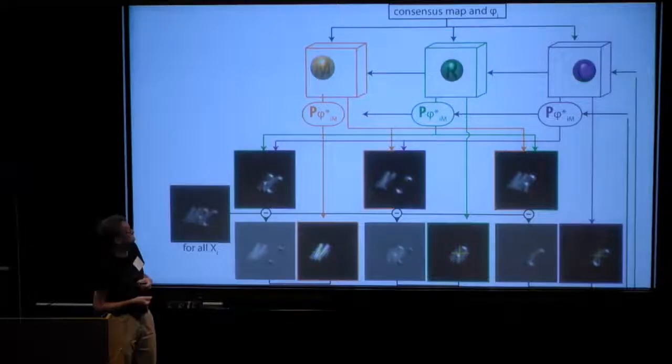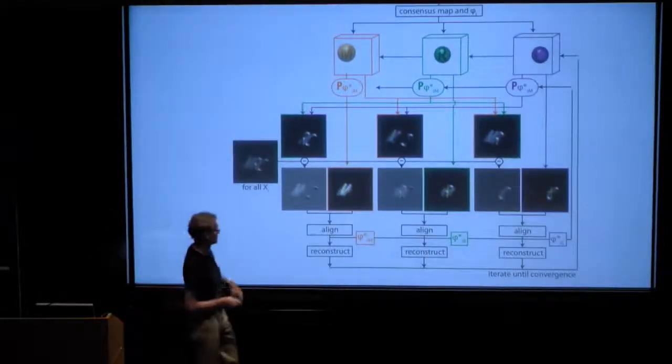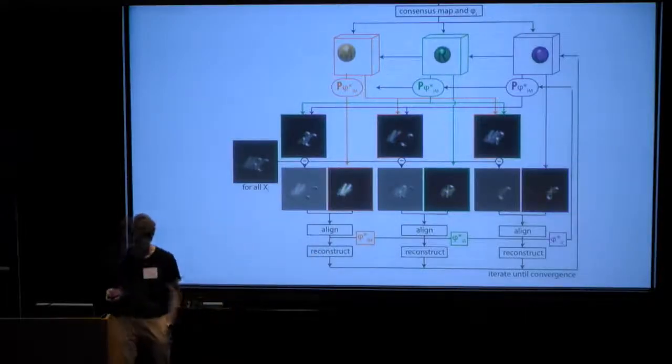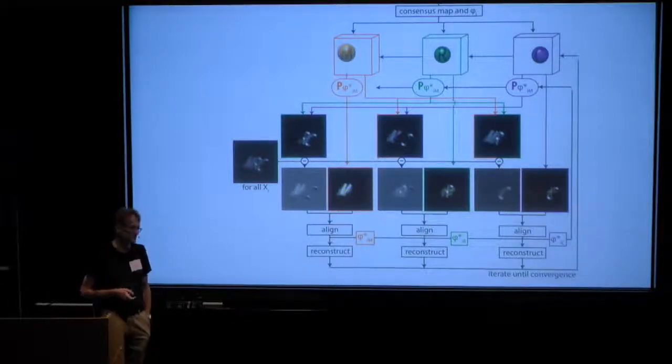And then for each of these, we try to focus on part 1, optimize the alignments and orientation for that, and then we do that for part 2, and then we do that for part 3, and eventually we bring all of these together into one large reconstruction, and hopefully have something that we're happier with. Now, the challenge with that is, by definition, that's not going to be one reconstruction, right? So these things are mobile relative to each other.